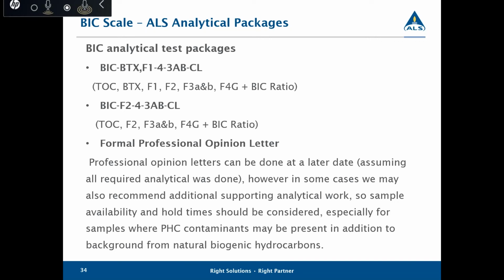So let's say maybe we need to run GCMS analysis for the PAHs. Also, hold times for the samples have to be considered. For all the soils, it's 14 days from the sampling. If other petroleum hydrocarbon contaminants are present, in addition to the background from natural biogenic hydrocarbons, and this analysis is not requested upfront, later on, maybe past hold time, the results won't be valid.